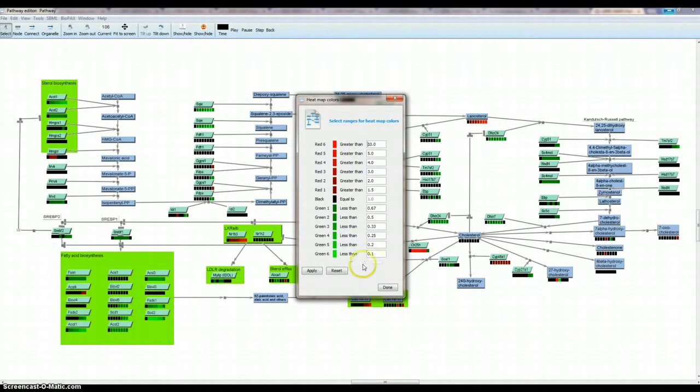See, this is what I like about this one. You can set the values in here, and then you have one that is fixed in the middle. The other free software packages I found didn't let you fix the middle at a set color and then start with the red going up and the green going down. You had to play with things based upon your data set to get it to balance out.